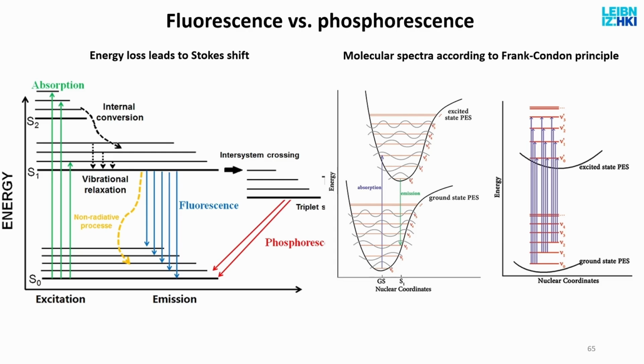So there is a spectrum, an excitation spectrum, which tells me from which level to which level the electron goes. So this means that if I say GFP requires 488 nanometer excitation, that's not true.